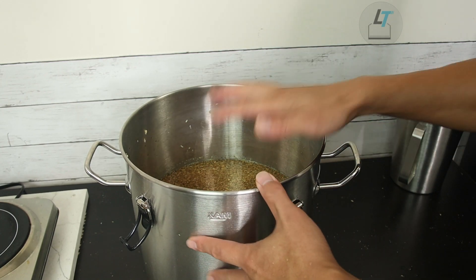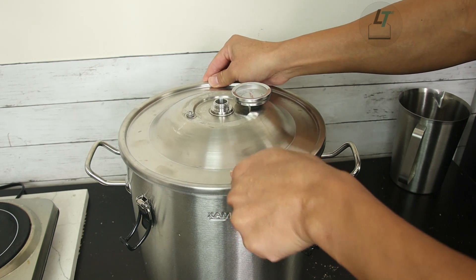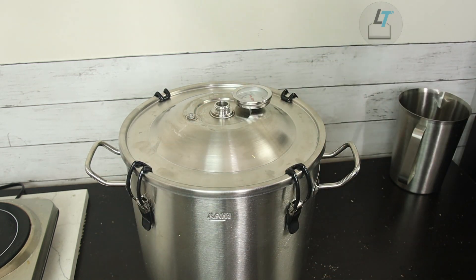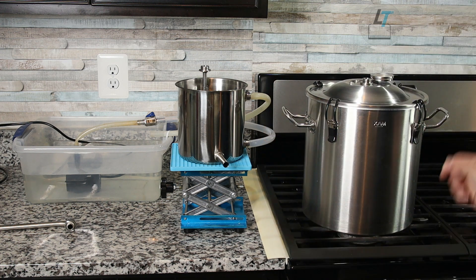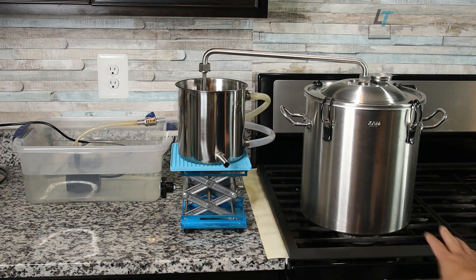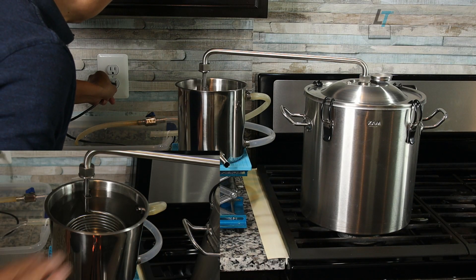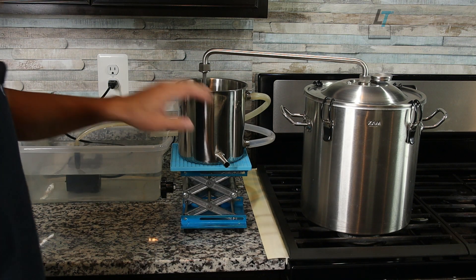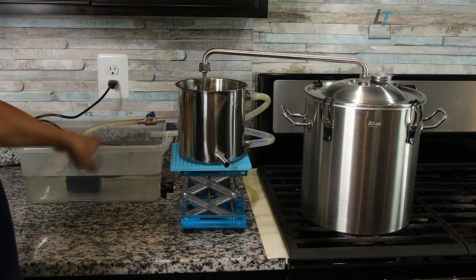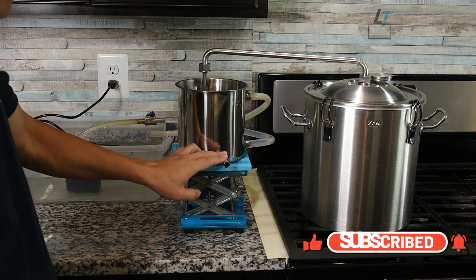Now the distiller is ready with the ginger mixed with water. Today I'm using circulation cooling. Before turning on the heat, remember to test the circulation and make sure it is stable. When you set up the circulation cooling, the cooling water goes in from the side of the condenser and goes back out to the bucket from the top. Your product — the distillate including essential oil and hydrosol — will come out from here.